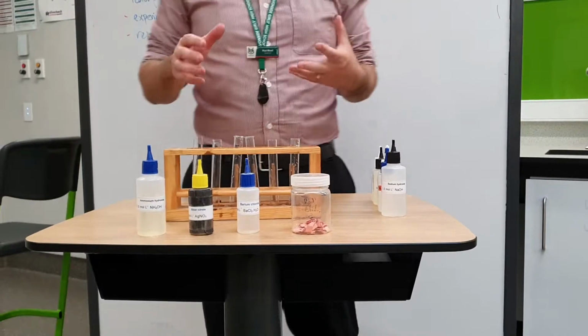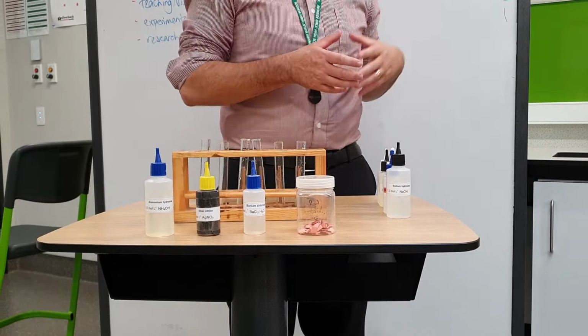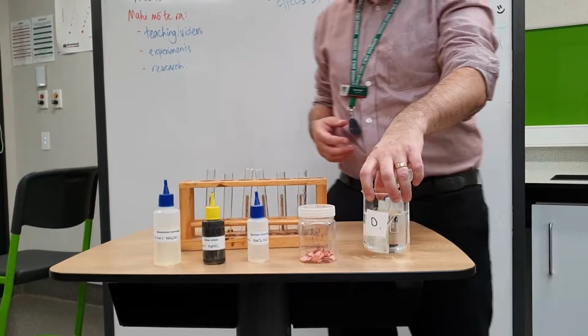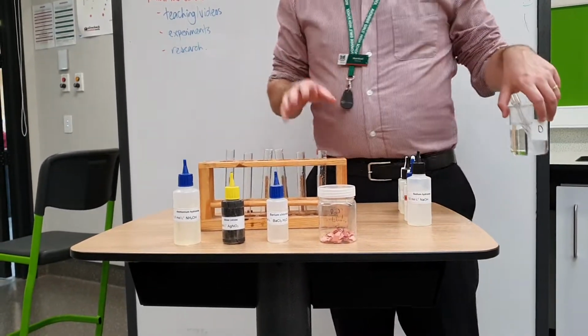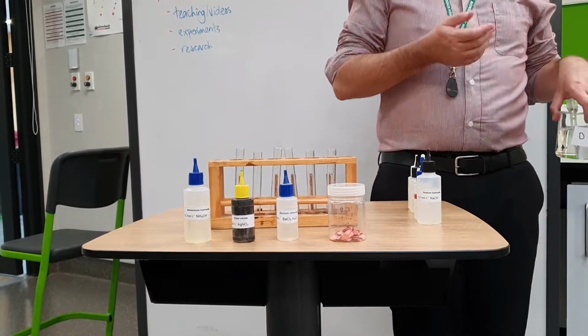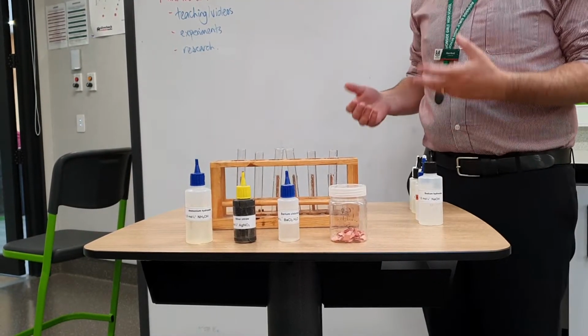Okay, so what we're going to do is make a series of videos that go through how we test for each anion. You're going to be given a solution where you don't know what the ions are in it. So it's just going to have a letter like A, B, C, D. For this video, I'm just going to go, if it was hydroxide, what observations would I expect, and are there any chemical equations that I have to write for that?